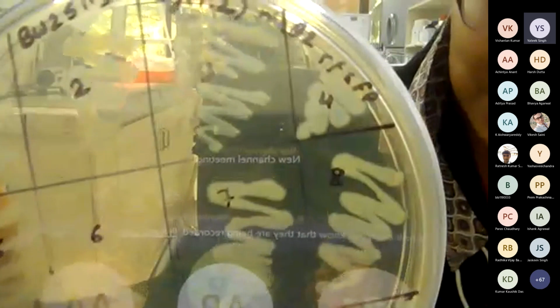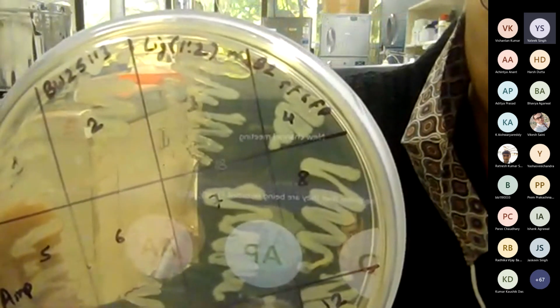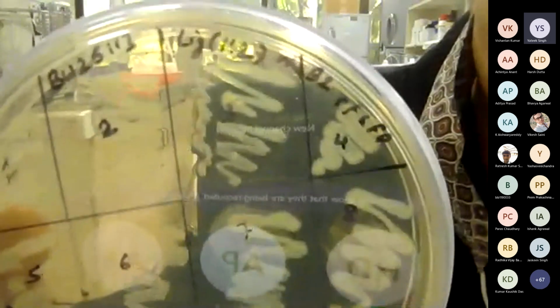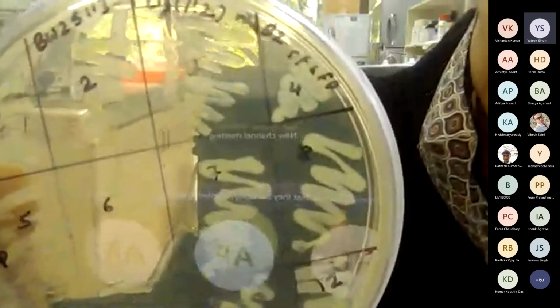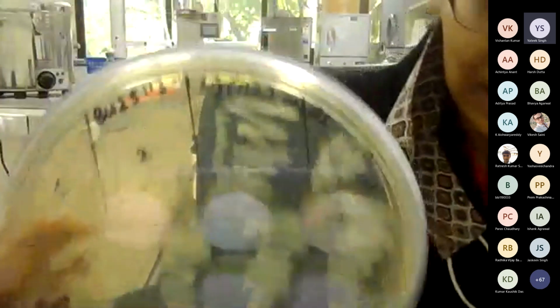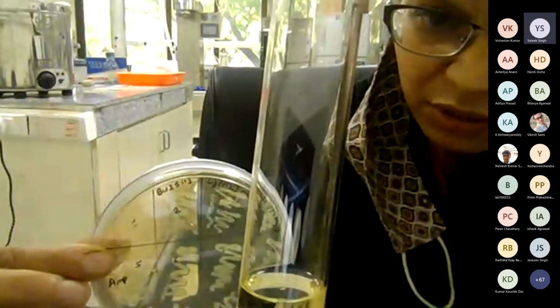We have confirmed the clone after taking out the plasmid with a plasmid DNA isolation kit, and we have checked with restriction digestion whether the vector size is proper, whether our insert size is proper, or if there is any other DNA contamination. So these are the confirmed clones which have our recombinant DNA. A single colony is picked from this one and we inoculate in 5 ml culture.